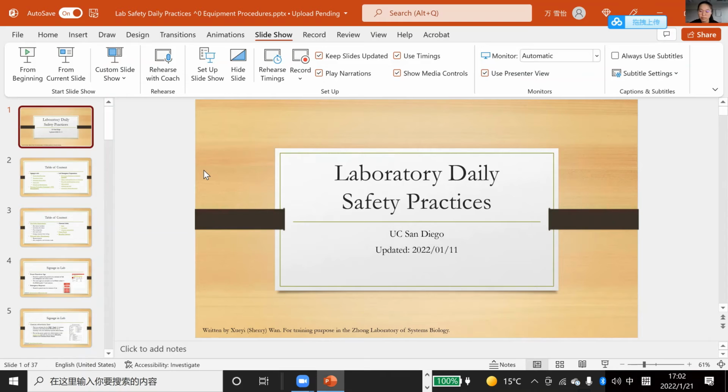From the last audit, when I was completing the audit with the inspector, he mentioned that we can only use that paper box, the biohazard paper box, to collect the pipette waste or waste tubes and stuff, and we need to keep it closed all the time. Oh yes, exactly. I forgot to add that one too.